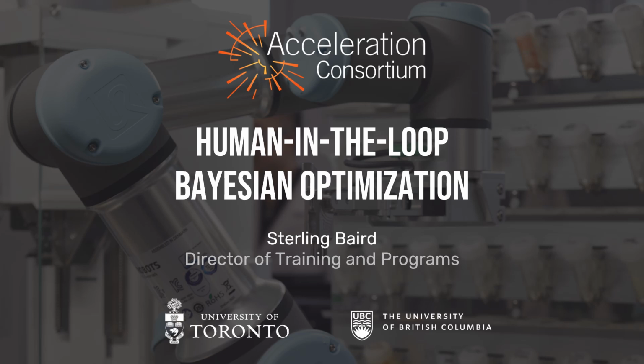In this video, I'm going to be talking about human-in-the-loop Bayesian optimization. And what I mean by human-in-the-loop in this case is that you have a Bayesian optimization algorithm that will suggest a new experiment, a next experiment for you to run. And then you take that suggestion and maybe you bring it into a chemistry wet lab or something that requires human input rather than this sort of programmatic function to run, and then you bring those results back to the algorithm. And so let's take an example on this next slide that shows what we're talking about and how to implement this.